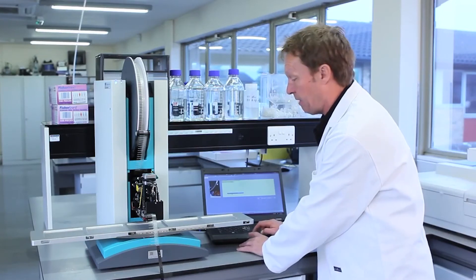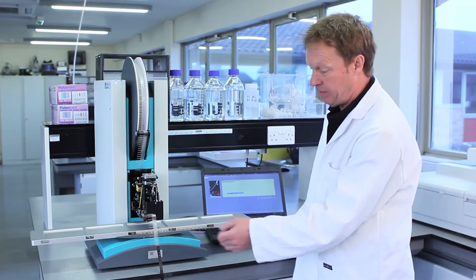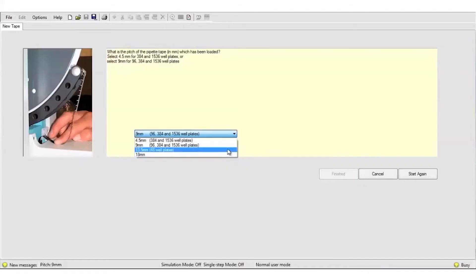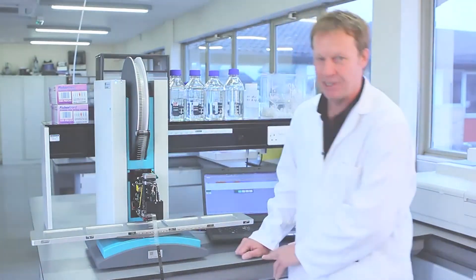This is where you choose the type of tape you're using because the mosquito can either use 9mm or 4.5mm. So we're using 9mm tape here. Finished. And that's how quick and easy it is to change the tape.